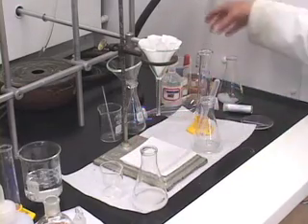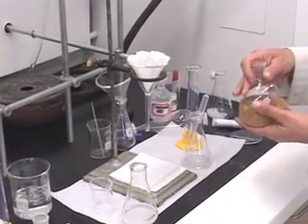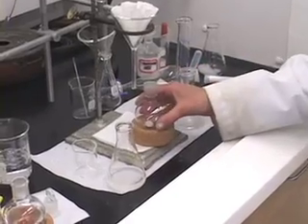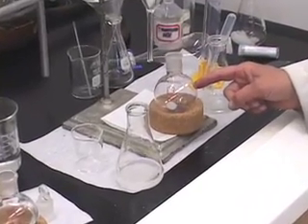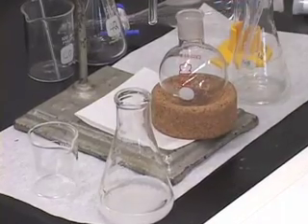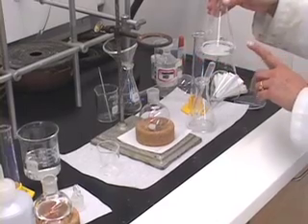Filter this solution into the second round bottom flask that you had kept ready for your acid component. Again, this round bottom flask has to be clean, dry, and pre-weighed. So do the same thing. Pour it through the funnel with the fluted filter paper.